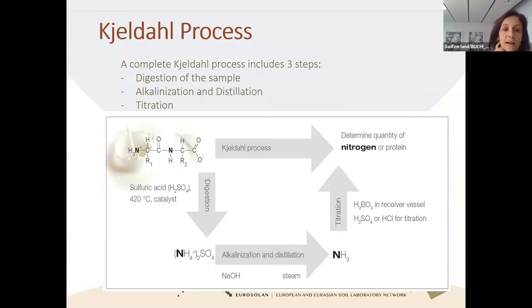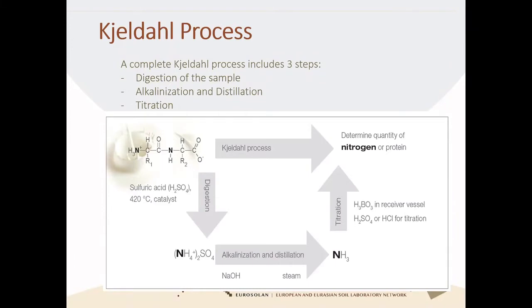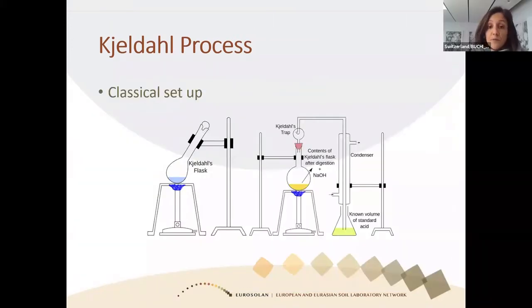The next step would be the alkalinization and distillation. During this step, the ammonia is liberated and then is steam distilled and ready for the next step, which would be a titration to finally determine the amount of nitrogen in the final solution. This is a classical setup for Kjeldahl, where we have the flask where the digestion occurs. Then we have another flask where the alkalinization and distillation happens, and the final stage for titration.